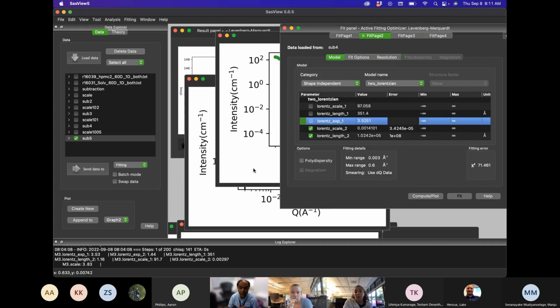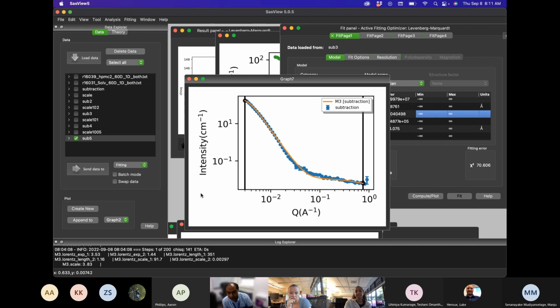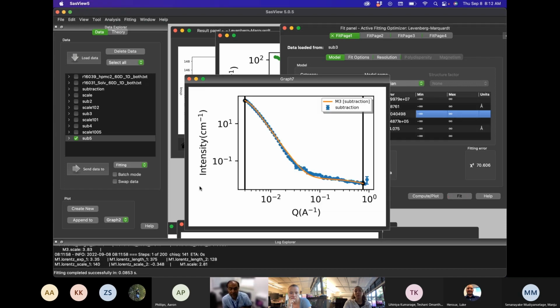So when you go to the blue and show the fit, with the fit one. Yeah, it's this. Should I fit the green one? You can, I have that here. No, I mean, I just want to show, when you look at the fit in the blue one, only at really high Q is the fit on the data. Otherwise, you're always fighting to be on the fit. So you're crossing over, right? Which means something is not catching it.